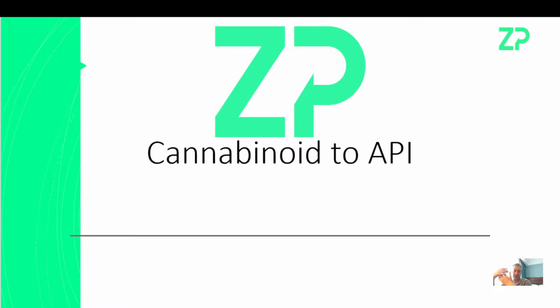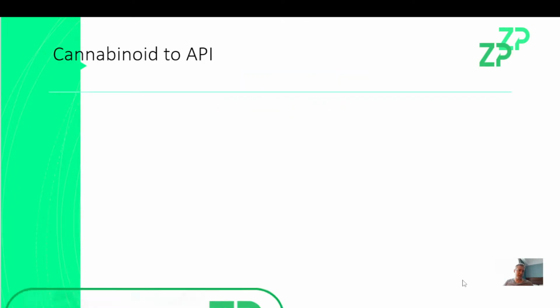Now, this technology stack is intended to be used by entrepreneurs and businesses and startups who want to develop a test for one of the cannabinoids. It could be like THC or CBD or both. So what we'll do now is we'll essentially jump into some of the material that we have here.